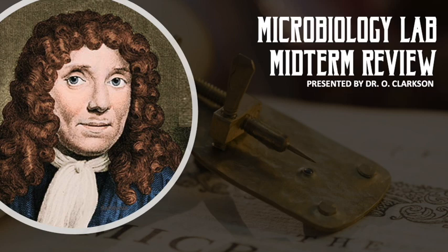Can you tell the difference between a T cell and a B cell lymphocyte? They look exactly the same.